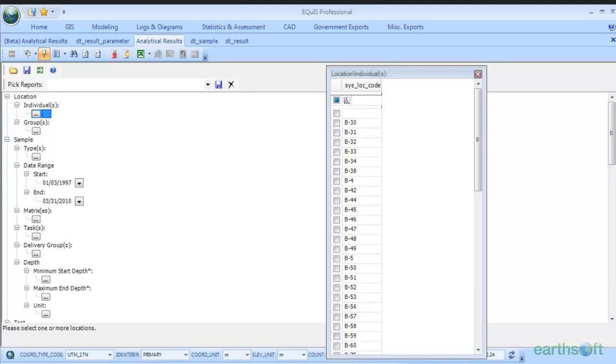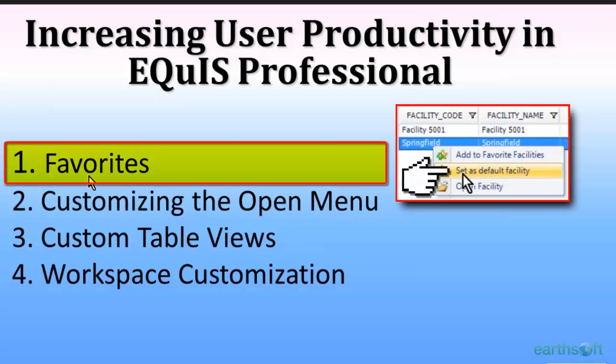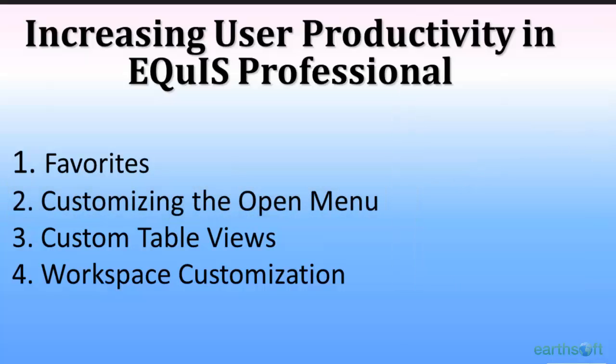Real quick, we're going to recap what we looked at today to hammer into your brains. We looked at creating favorites in the login menu, the login connection screen, as well as creating favorite reports and menu items. We looked at customizing the open menu, selecting multiple objects at the same time, and selecting the data table view, with just the filter row view, as well as looked at how report groups and subgroups work.